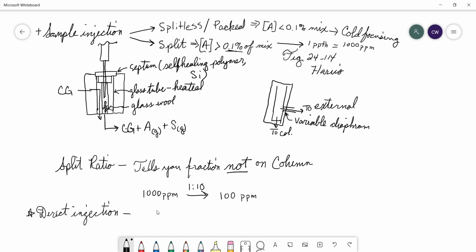These samples are directly injected onto the column, as you might imagine. There is no injection oven. Chromatography is initiated by warming the column.